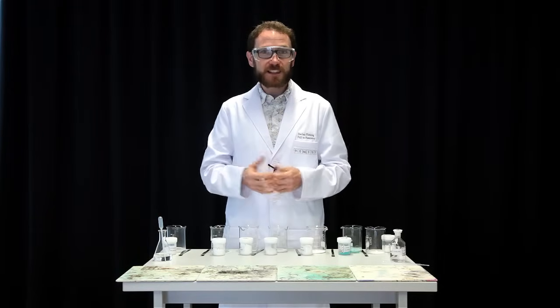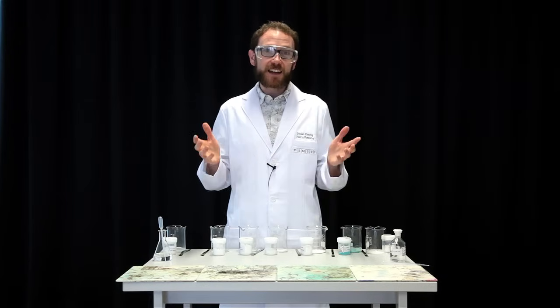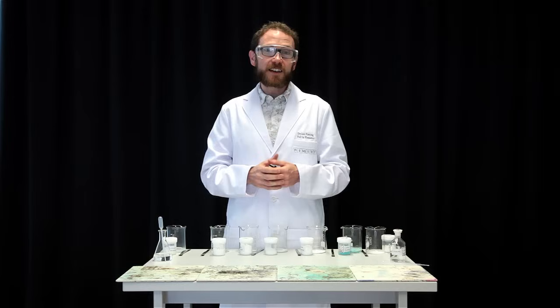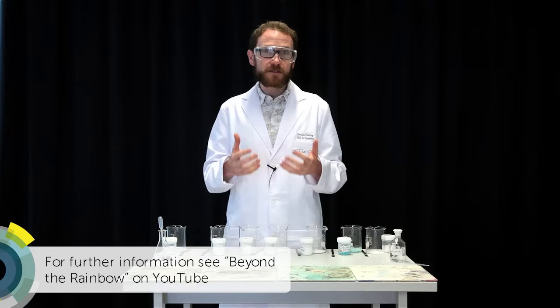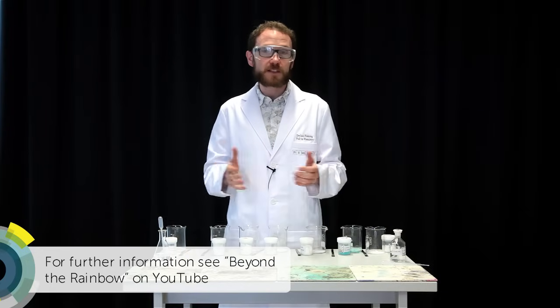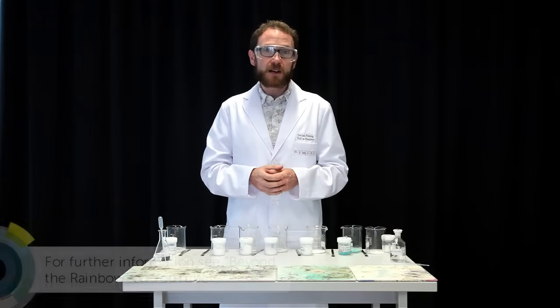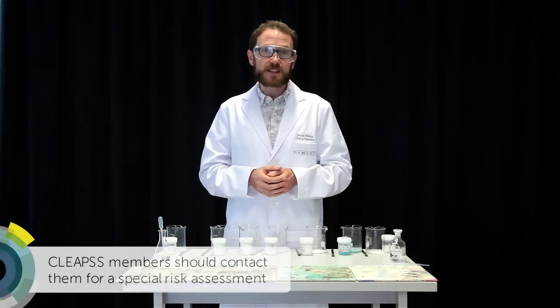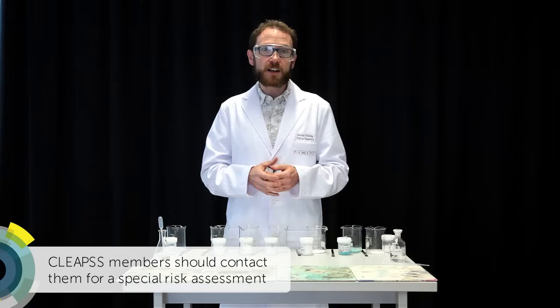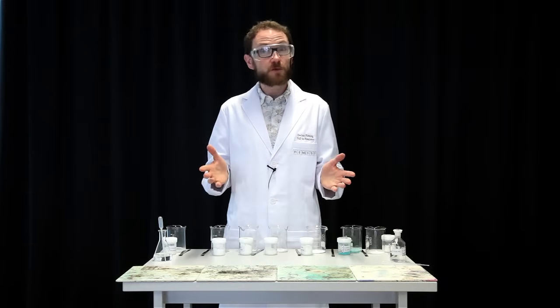The summer beard is ready for a trim. September's just around the corner, so it's time for our next education in chemistry. This month we're visiting a demonstration that has caused some life-changing injuries in the U.S. and has even had some calls for it to be banned. But there's absolutely no reason for this demonstration to be banned as long as we're doing it safely and paying attention to the choice of solvent. It's recently been revisited by Peter Hoare, and CLEEPS have issued a new risk assessment. This is Rainbow Flames.